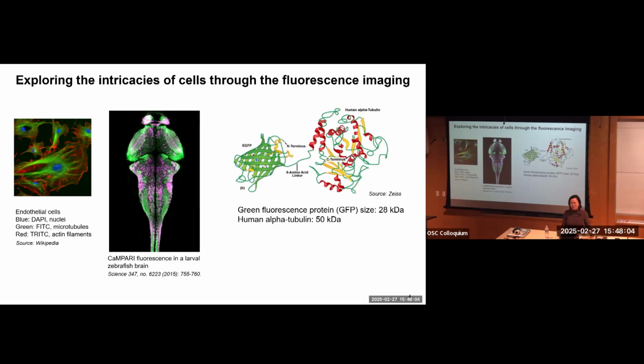So the bigger size will potentially cause perturbation to normal physiology. For example, when it interacts with another protein, dragging the whole big label along will cause some perturbation. And more importantly, it's often hard to label small molecules, which prevents us from using this powerful technology to study important biological phenomena, such as metabolism.